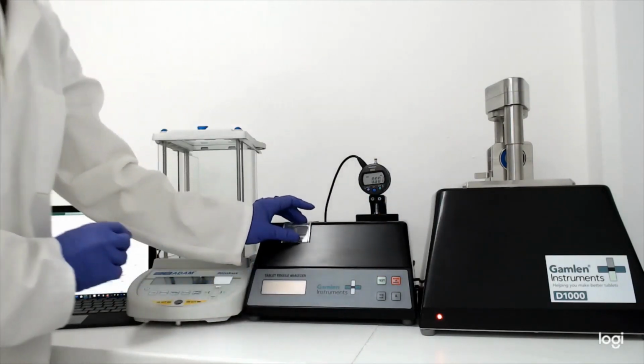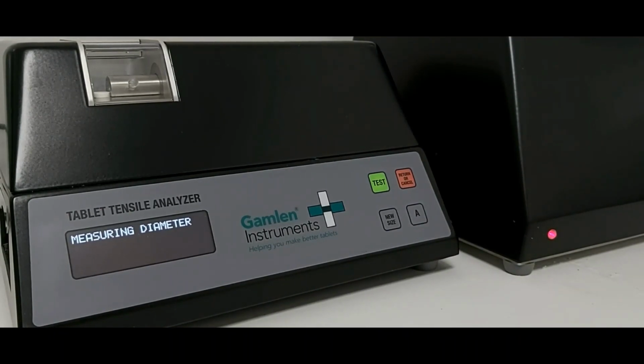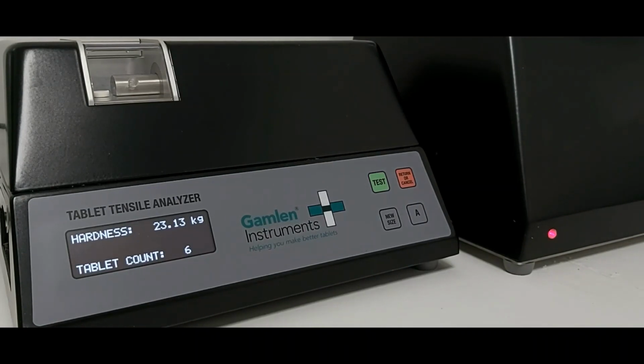And finally, we're putting the tablet into the jaws of the TTA. Similarly to a hardness tester, the jaws close on the tablet in order to measure its diameter, and then it will measure the force required to break the tablet. If you're familiar with hardness testers, as I said, it's quite similar. Our TTA is on the more sensitive side of hardness testers.